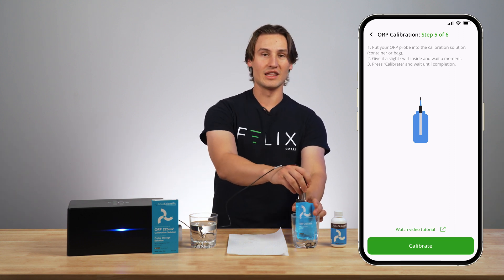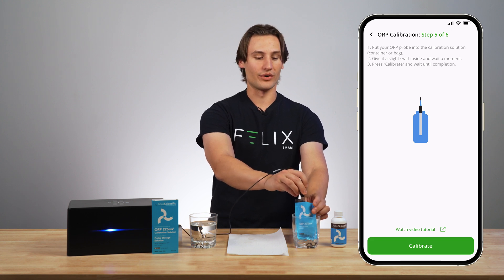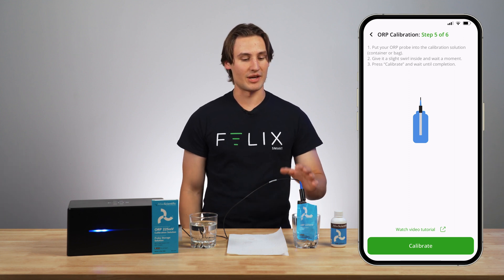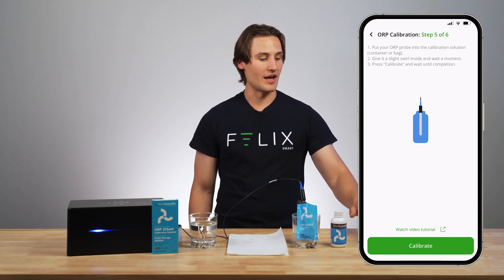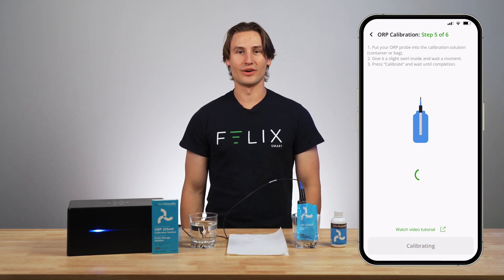So I'm going to stick this in the bag and lightly swirl it around, then give it a moment. You want to wait about 15 to 20 seconds just to make sure everything is all good in the bag, and then you're able to click calibrate. So I will wait patiently until completion.